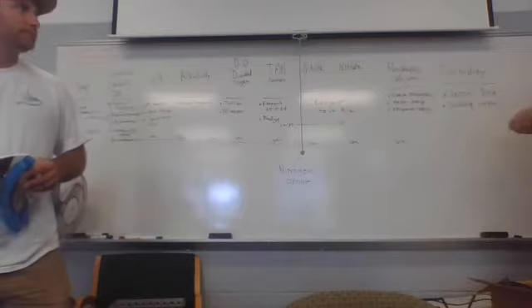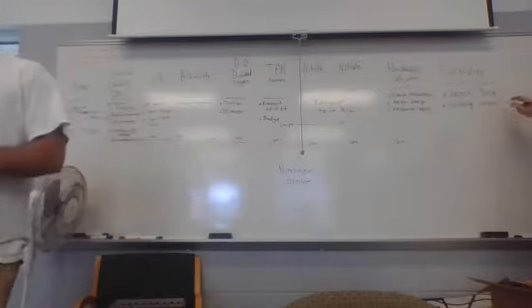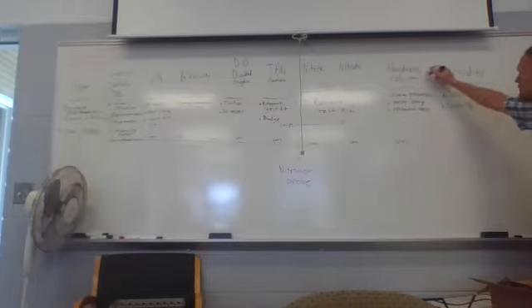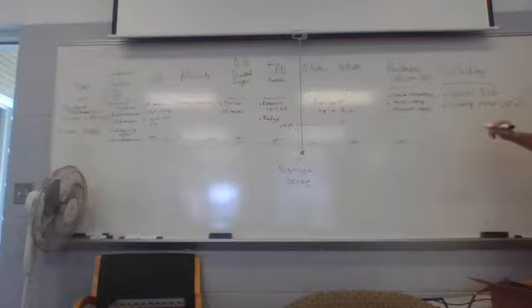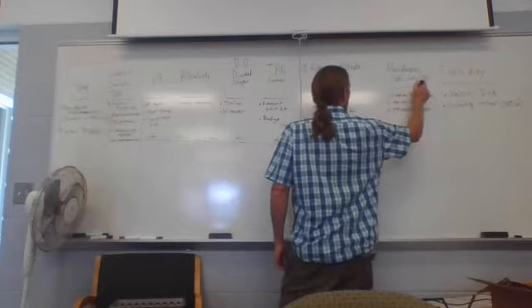Does it say what the units would be if you're using that? We should put units for all these things. NTU. I'm not even going to pretend to pronounce the first words. Isn't it Nephelometric Turbidity Units or something like that? We'll just call it NTU. Hardness, all of these would be in degrees or parts per million, right? ppm CaCO3.